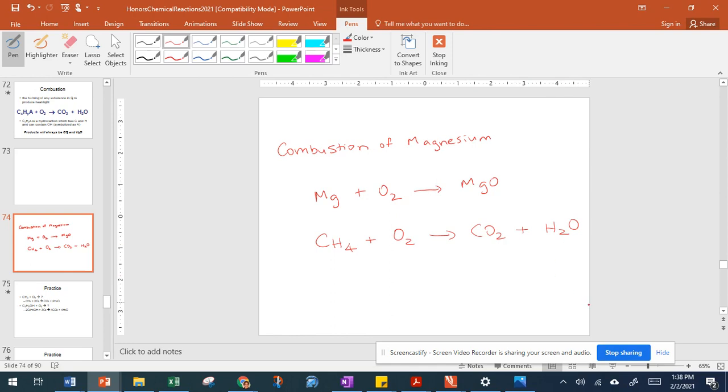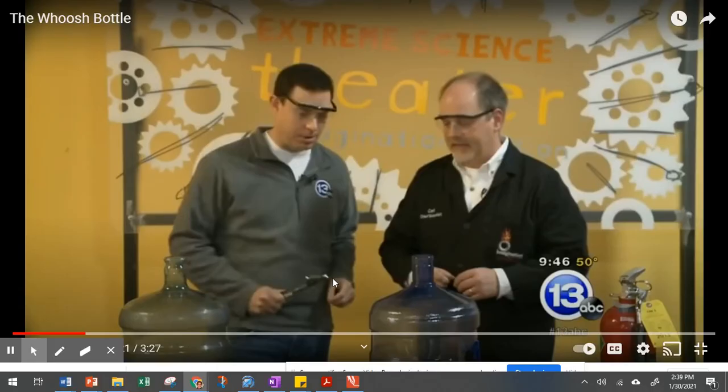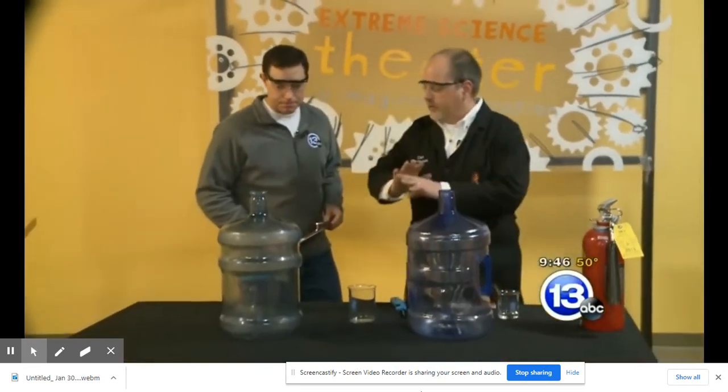Okay, so I'm going to now show you the whoosh bottle demonstration. This is actually going to be the burning of ethanol in this case to produce carbon dioxide and water. So watch this. All right, take it away, Carl. So we've got a 5-gallon water jug. It's completely dry and empty.